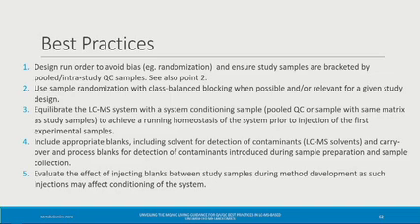And again, I'll show data about this in a couple of slides, but your blank samples can potentially interfere with the samples that come after them in some analyses. So you want to make sure that you check and verify whether this is a problem or not for your particular study while you're doing your method development.